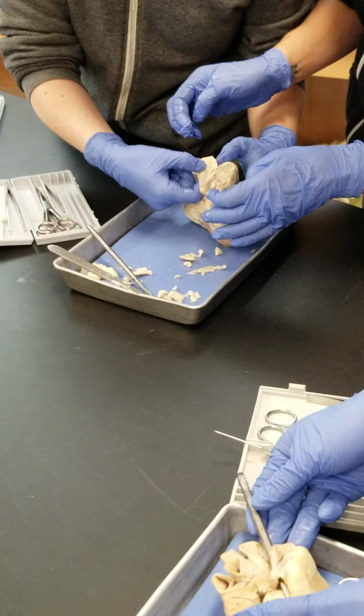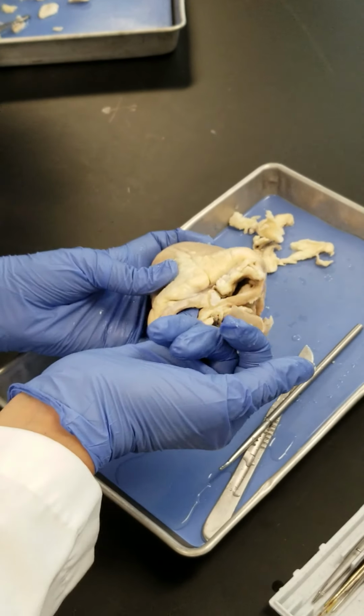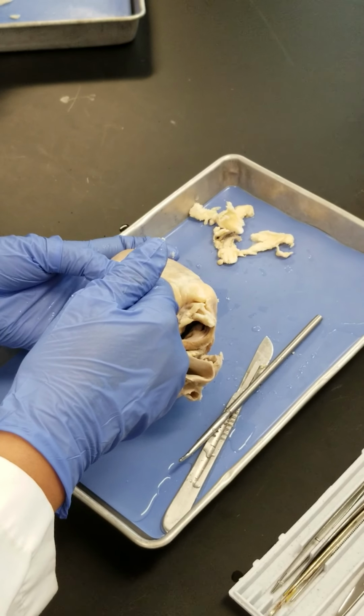This is posterior. So did you find the other one? If you go this way, put your finger inside and go around until your finger can come out. That's it, it's blocked. Right? This would be inferior.